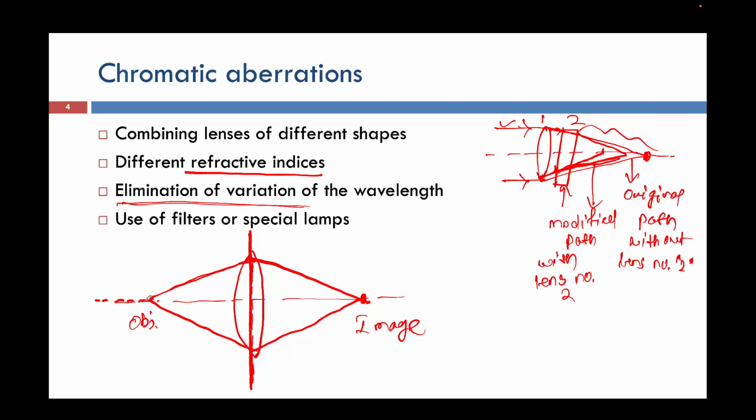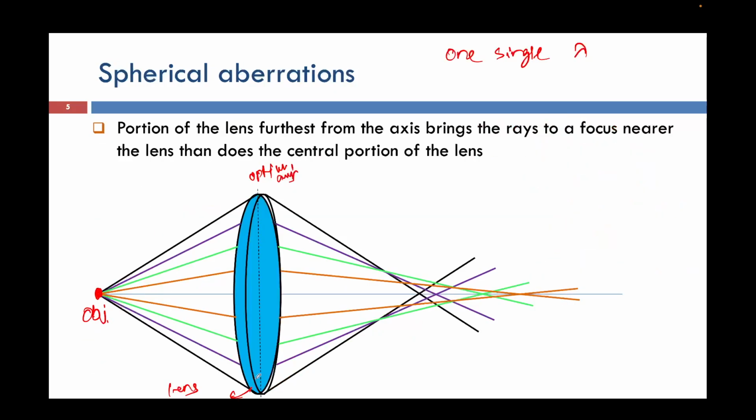There is a little bit of correction. So this is the optic axis, not this one. This is the optic axis, this is the lens axis, sorry. If you have written anywhere, just correct that. This is the optic axis, that is the lens axis. So what we have done is take the refraction of this incident ray always from the center of the lens. Why? Because we have assumed that the lenses are perfect, right? So this is the lens axis, and this is the optic axis.